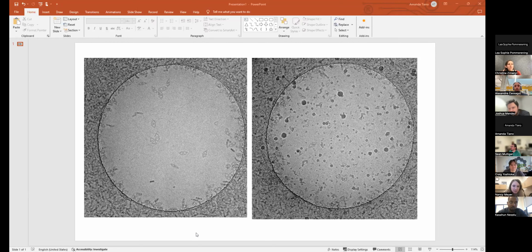In the other example, we couldn't see any sample on the carbon. So yeah, just to call attention to that. Graphene might help. Yeah, I'm just saying because in the other example, they couldn't find anything inside of the hole, but we couldn't find anything outside the hole as well. And here we can see, it's just to let them know.